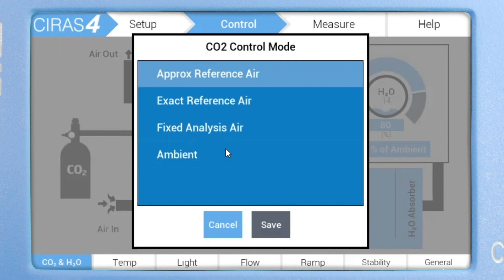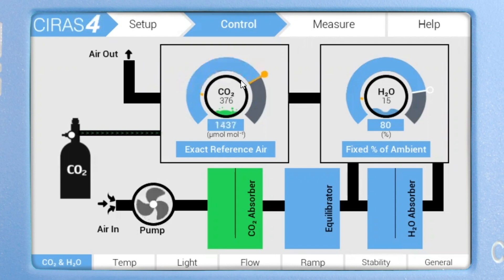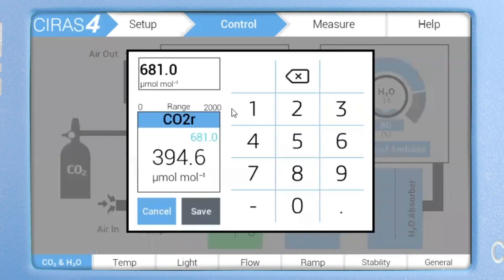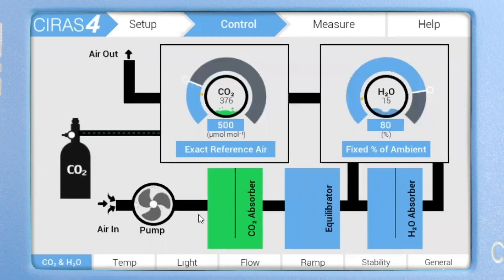Let's select reference air. You can use the slider control to increase or decrease the CO2 concentration, or simply enter a new value by tapping on the current concentration button, which in this case will be 500 micromoles per mole.